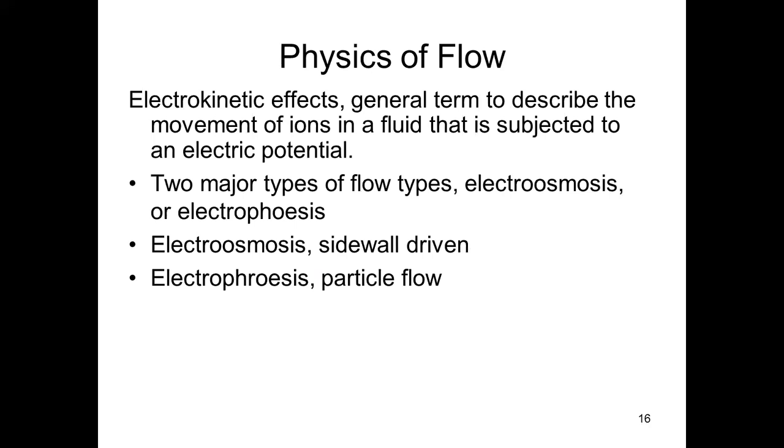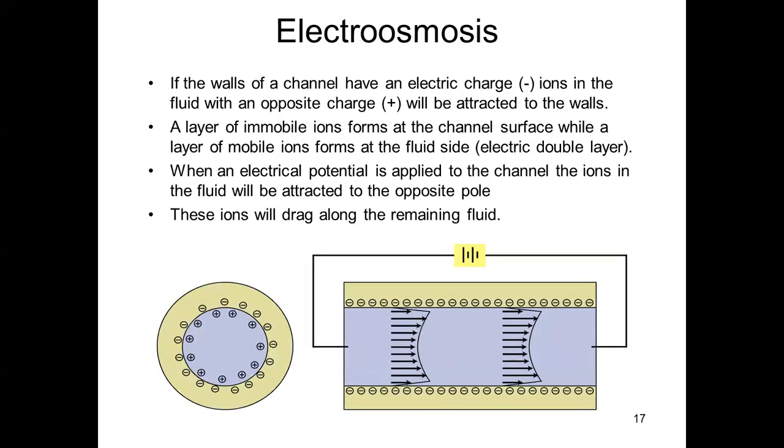One of the reasons we would like that to be the case is that the fluid would otherwise be flowing in opposite directions. So we would like one fluid regime to be dominant so that we know which way the fluid is flowing, so that we could design valves and chambers, etc.